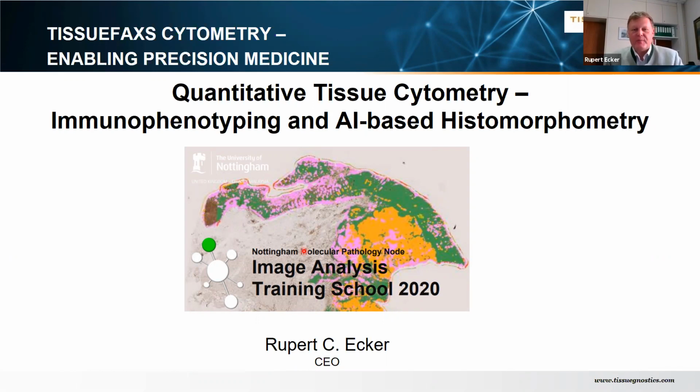Before I start with my actual presentation, I would like to answer your question or your statement about software hacking of images, Lech. In fact, it is a very good point. There has been an initiative called the OME, the Open Microscopy Environment, where vendors come together and work on a joint format so that there's an easy exchange between data and images possible between the different platforms.